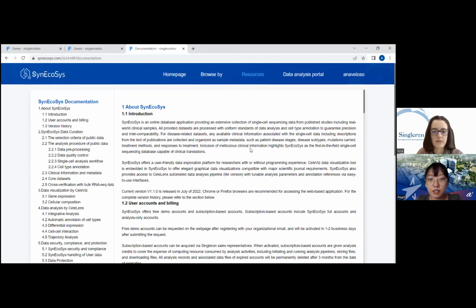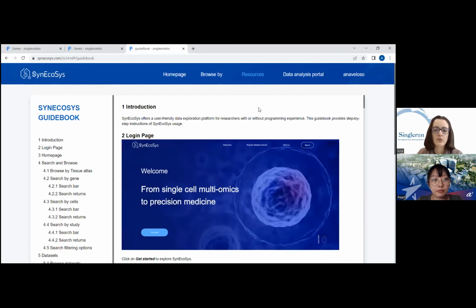Okay, thank you, Anna. So the next question is: is there a guide for this system? Yes, so you can see also in the resources, there's a guidebook, and the guidebook shows you step by step with print screens how to use every single part of this. In our YouTube page, you can also find short videos, like 2 to 3 minute videos on how to use every section of the analysis as well.